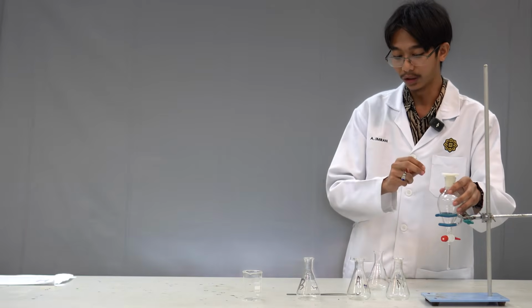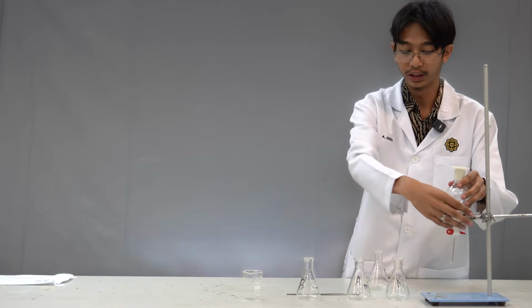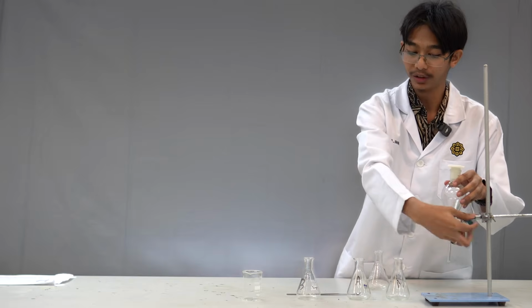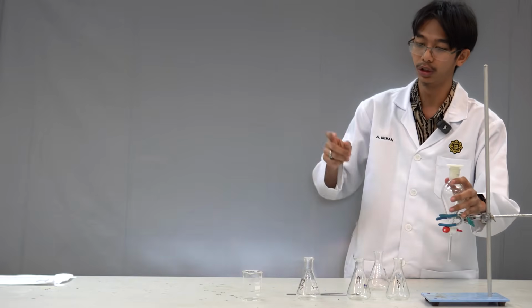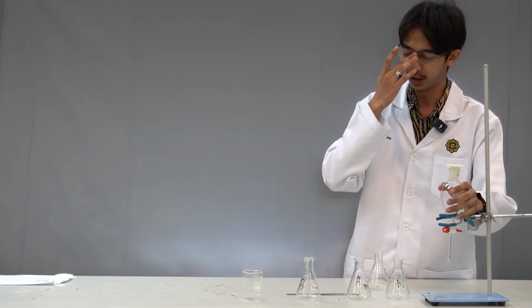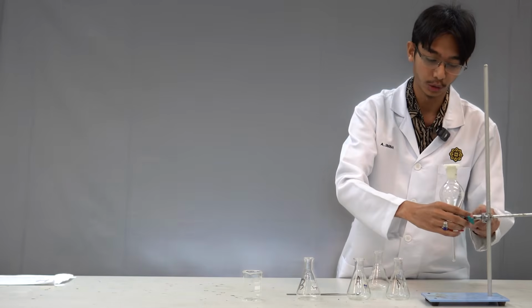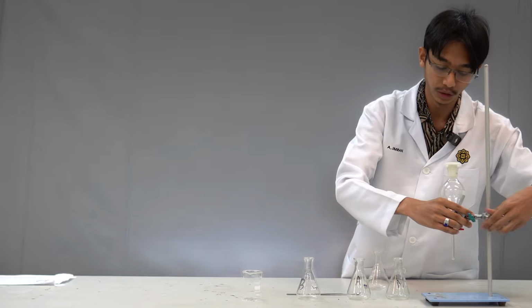From here, we want to extract acid. That's going to be my point. I'll be passing on the extraction of base and neutral to Brother Abdullah after this. So let's just do a basic rundown, shall we?